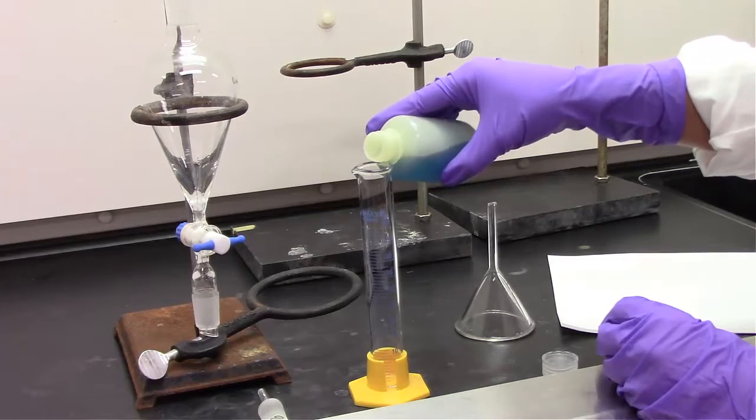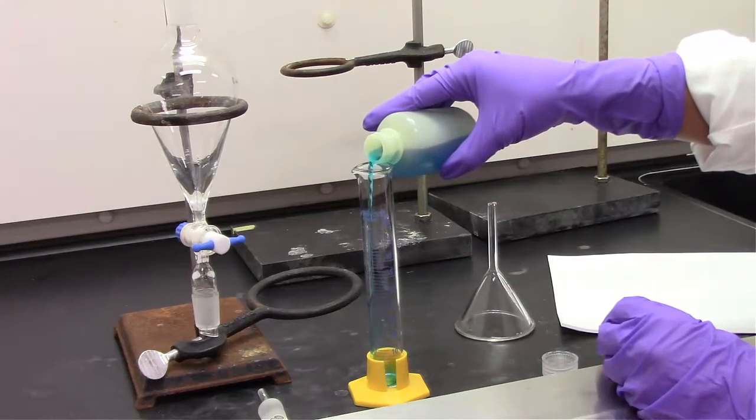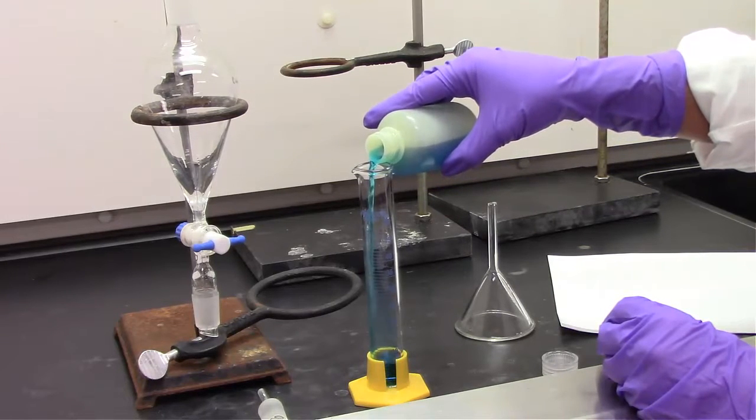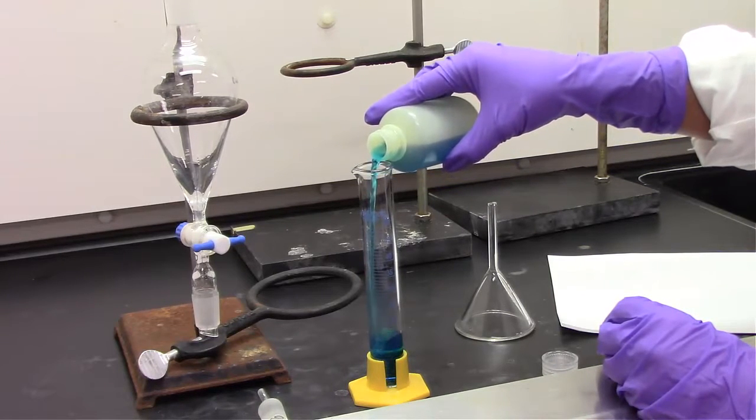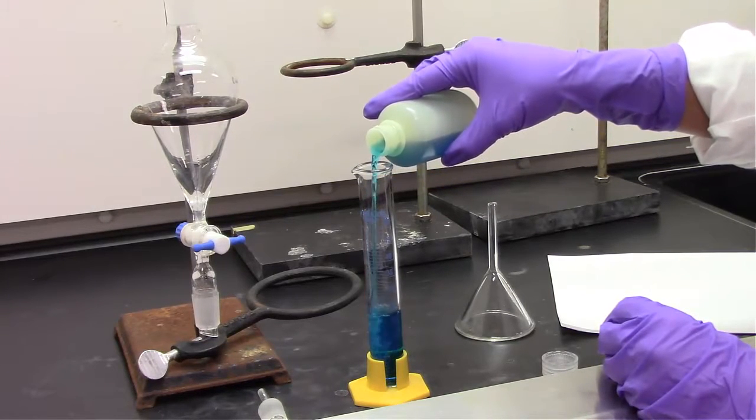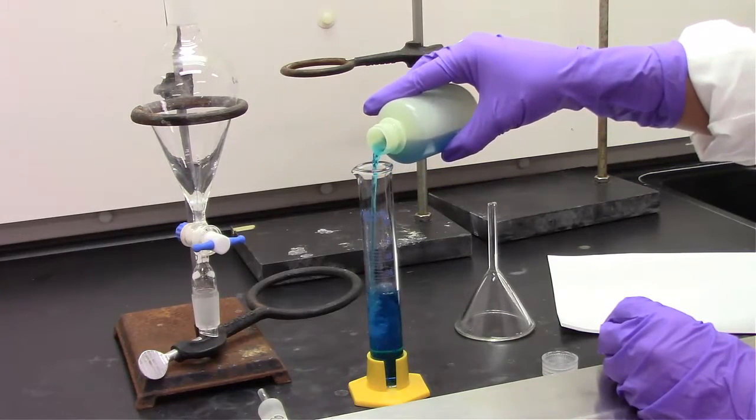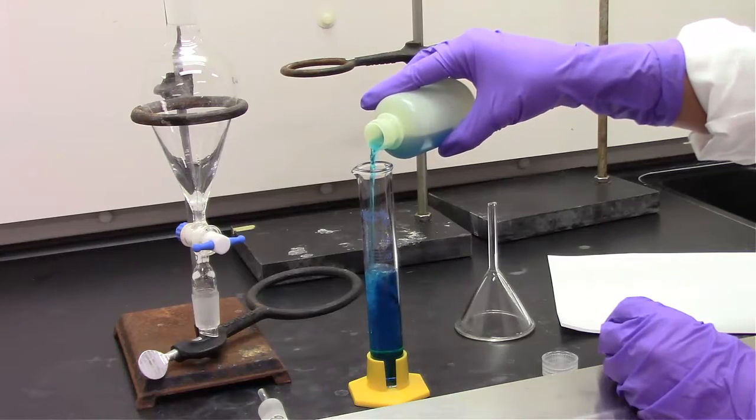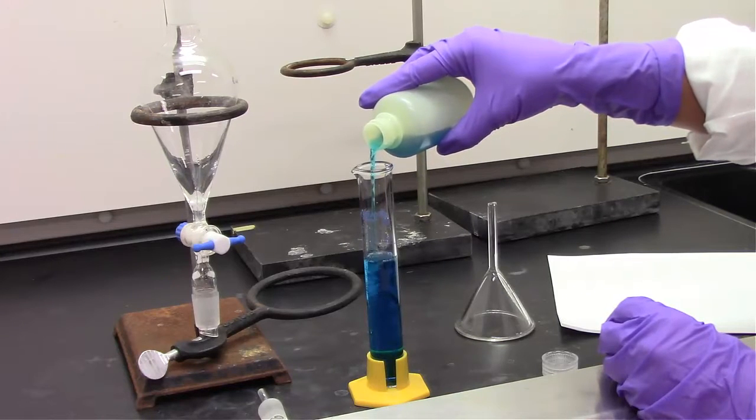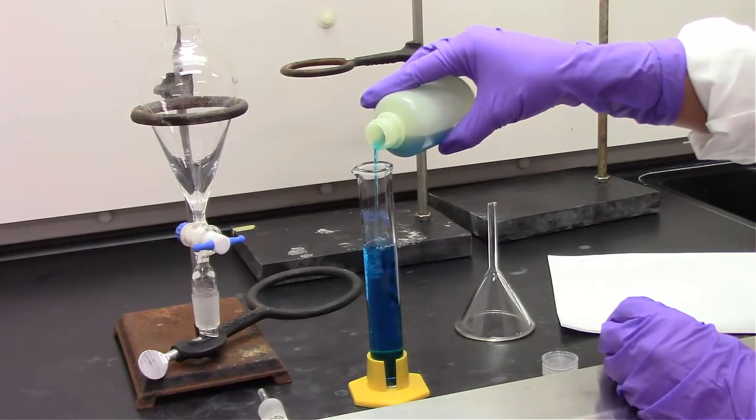In this experiment, we are going to look at a mixture of acetone and water, also with some blue dye in it, and try to separate the acetone from the water.